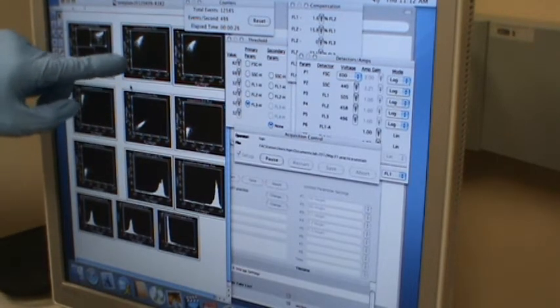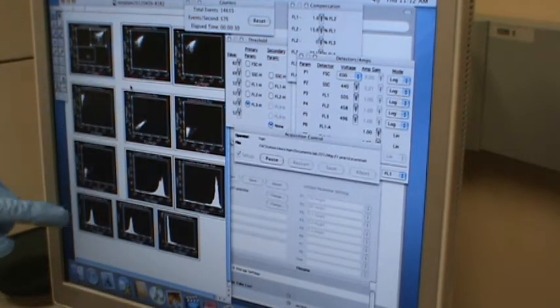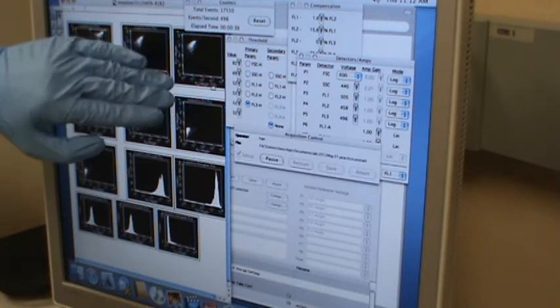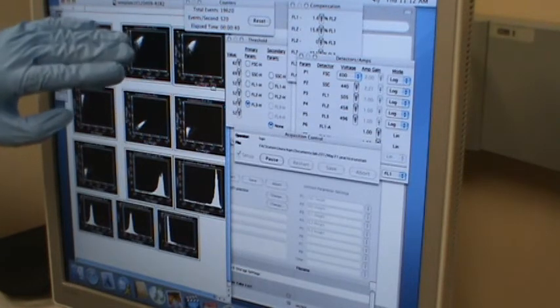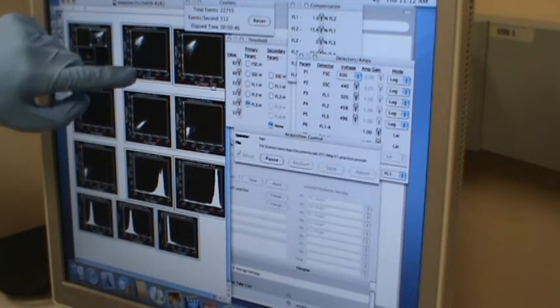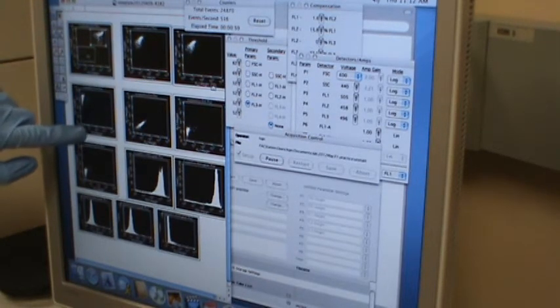So this is FSC, cell size. That's channel 1. I have channel 2 and channel 3. Both of the channels, you see the signal. You still see some baseline signal. There's no fluorescence, those are just baseline signals. You still see some baseline signal like 50. This is probably also like 30 or 40. For this channel, the baseline is less than 10.